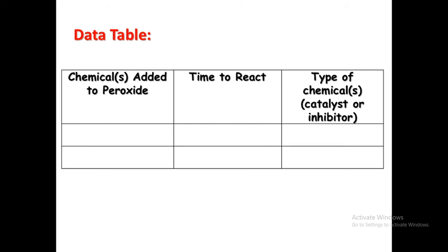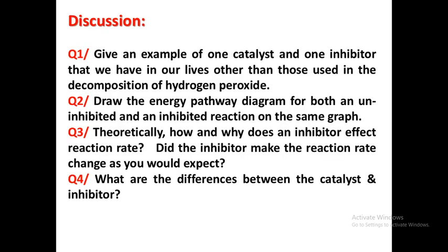Data table for the calculation: chemicals used, hydrogen peroxide, time to react, and whether this chemical is the catalyst or inhibitor. And this is the discussion, some questions about the inhibitors.